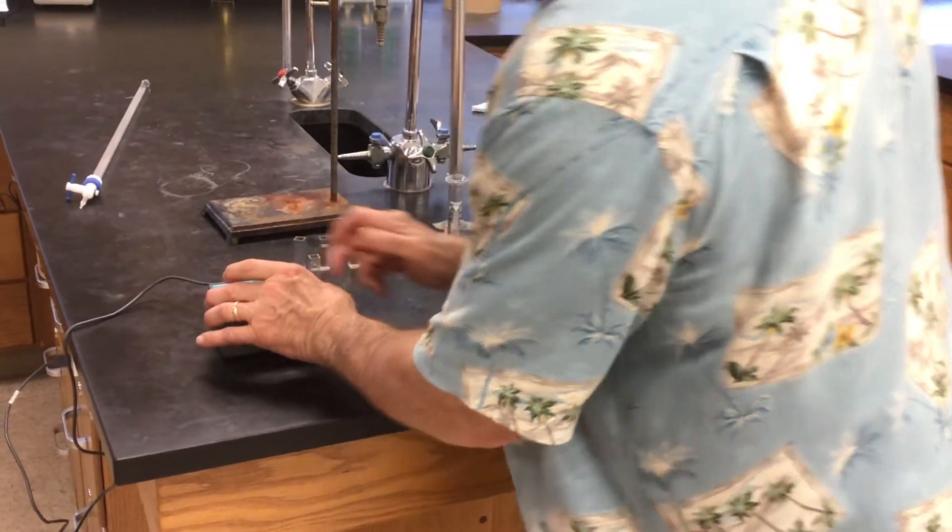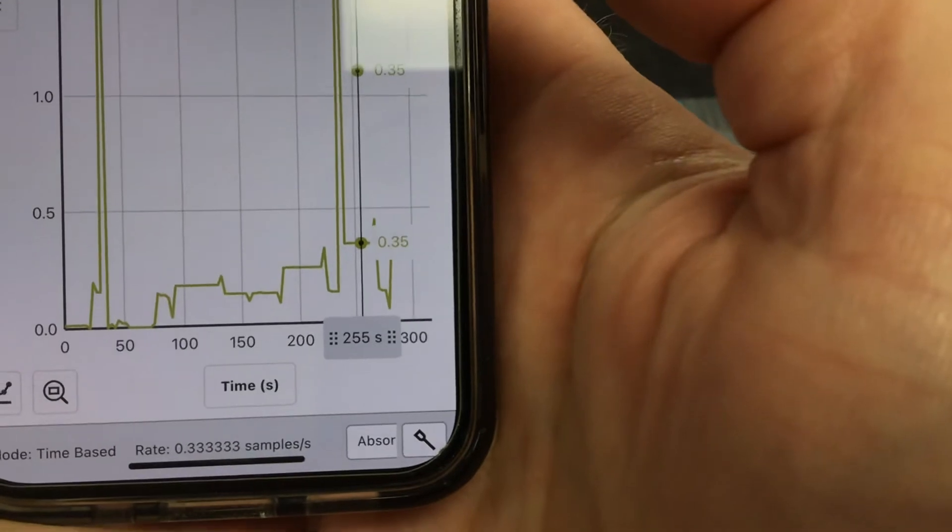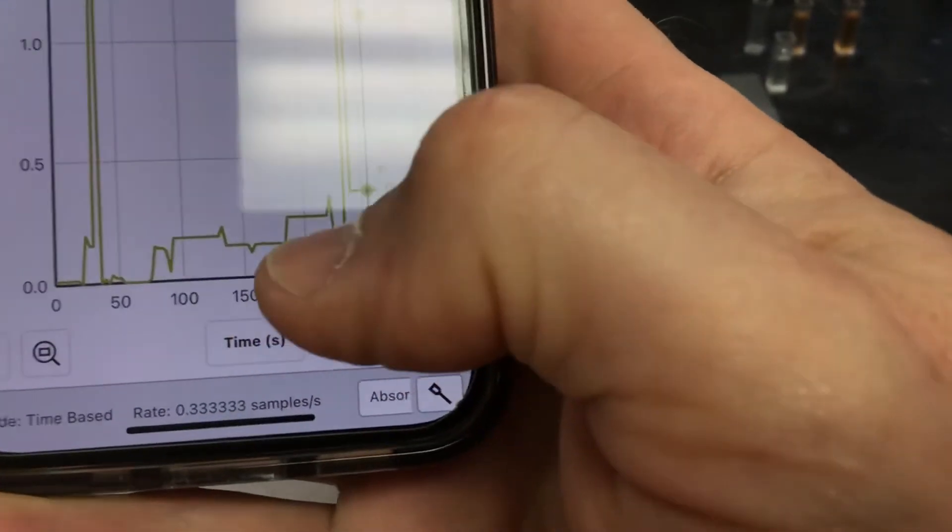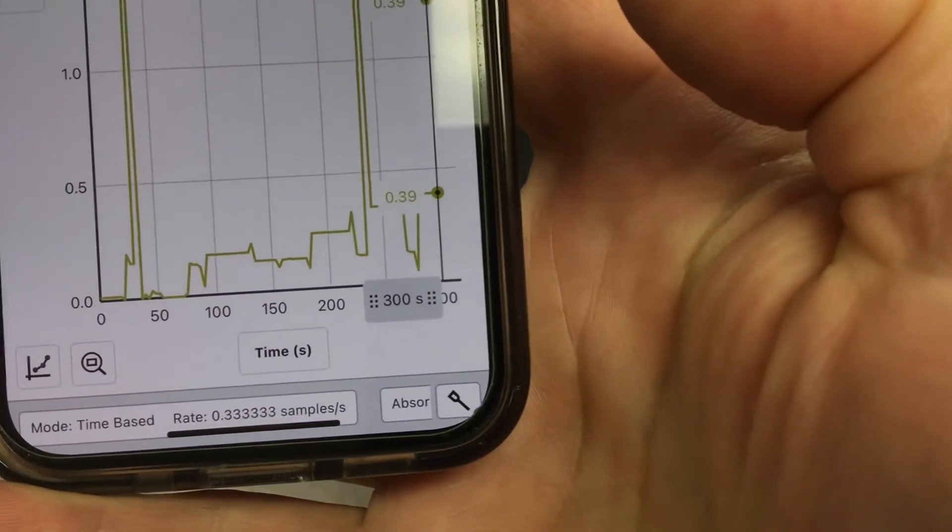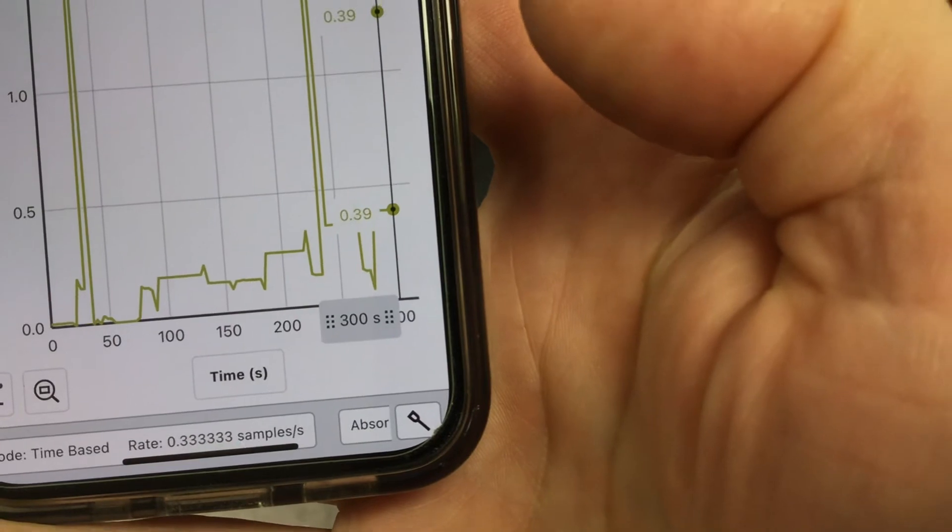All right. One more. Here's our fourth trial. Four trials, 0.39 absorbance. Okay. Got any more trials, Mr. Hevel? No, that does it. Okay. We got four data points here.